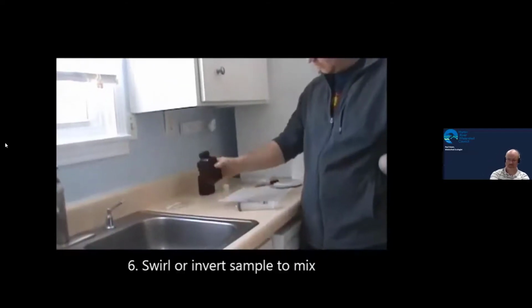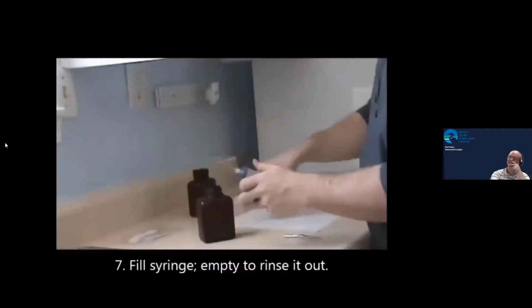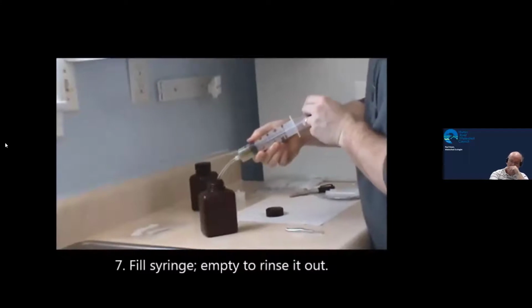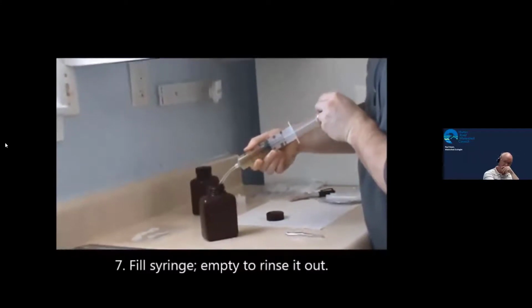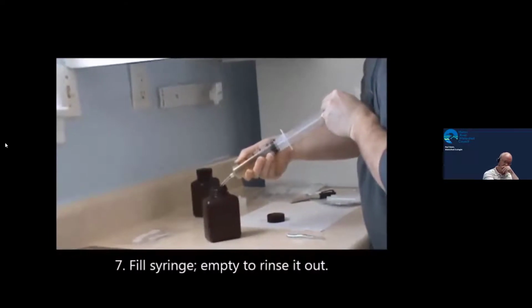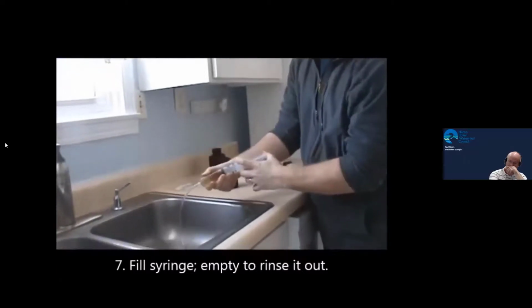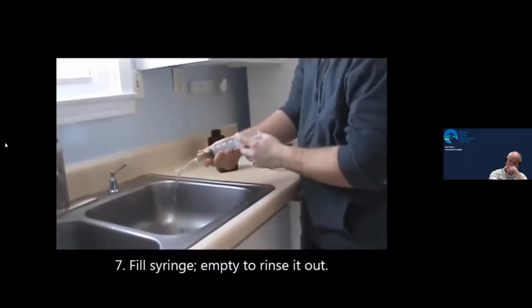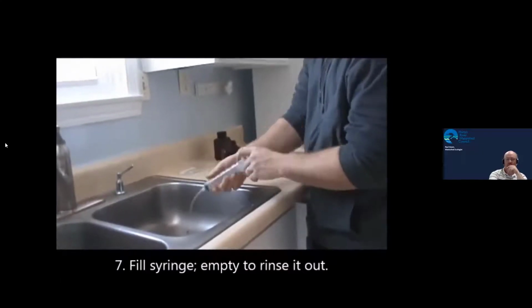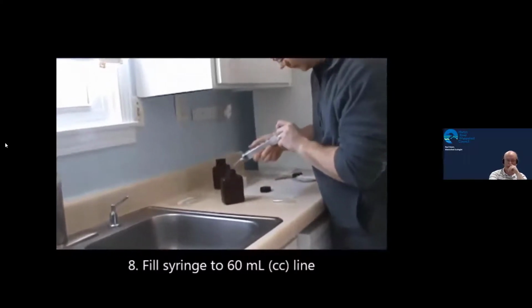Swirl or invert one of the amber bottles to mix. Rinse the syringe by drawing up sample water until the syringe is full, and then empty it. Then fill it up to the 60 milliliter line.